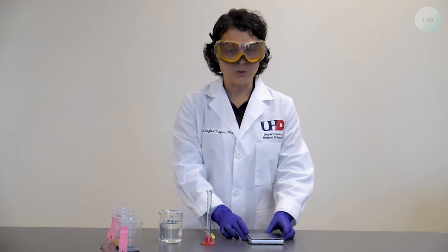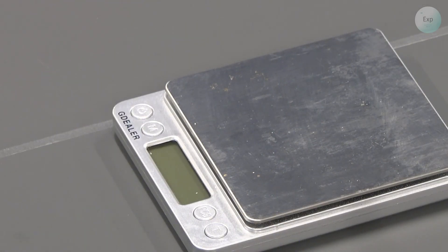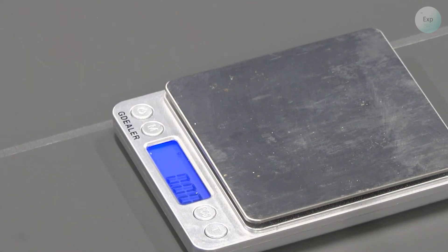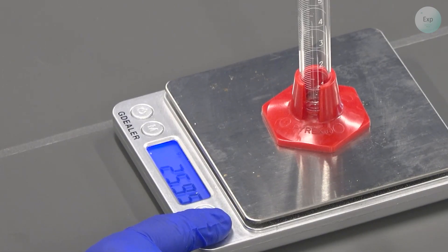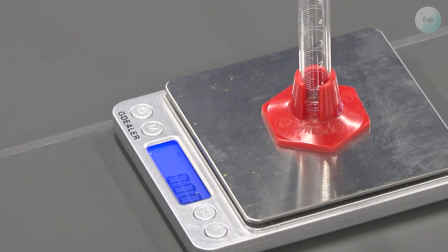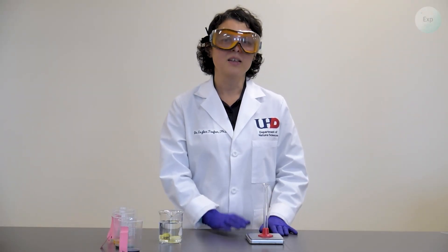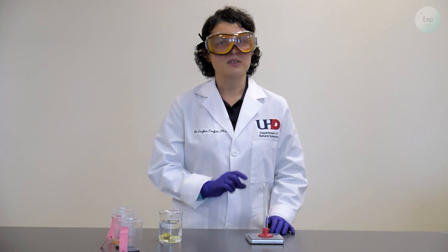The first thing that we need to record for density is going to be mass. To record the mass, we're going to turn on our scale. When it shows 0.00, we will place our graduated cylinder on top. We're going to tare, and then we're going to transfer a small amount of water into the graduated cylinder. Because we tared it, it means that whatever we add to it is going to be just the mass of the water.